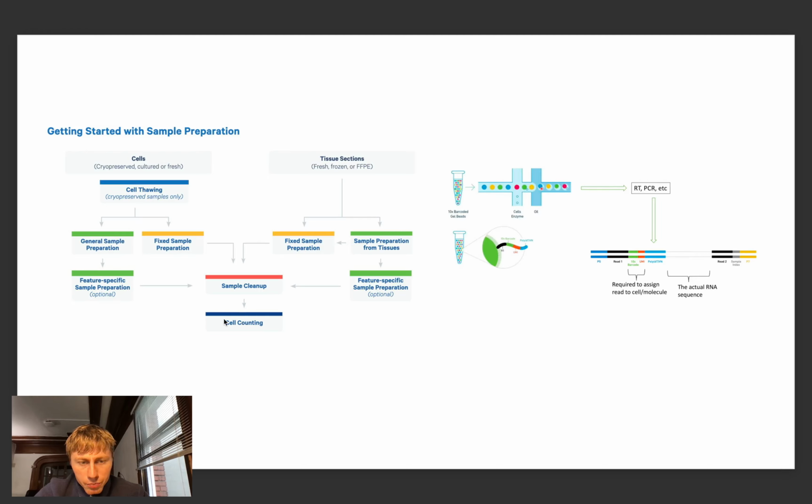Cell counting will then ensure that you have over 300,000 cells. Then you add the cells and the suspensions and everything, like a kit. You can watch a YouTube video for this as well, and I will also link it.